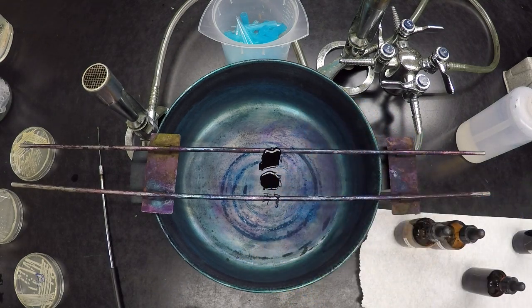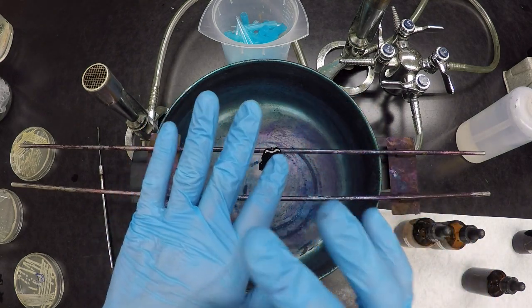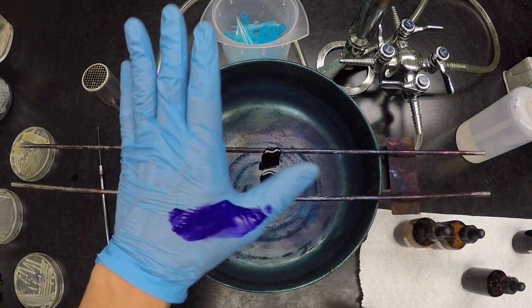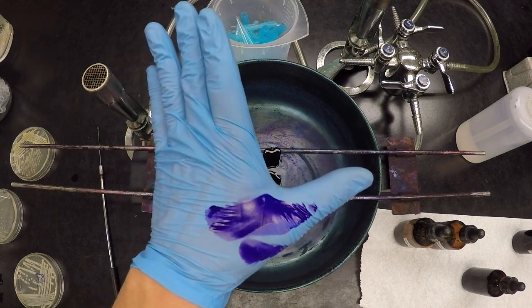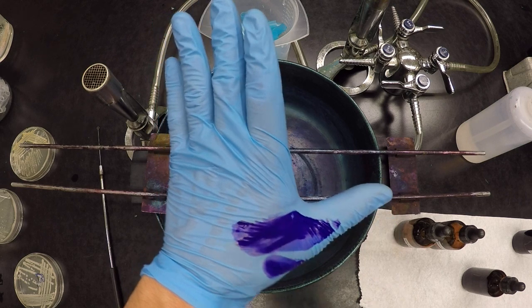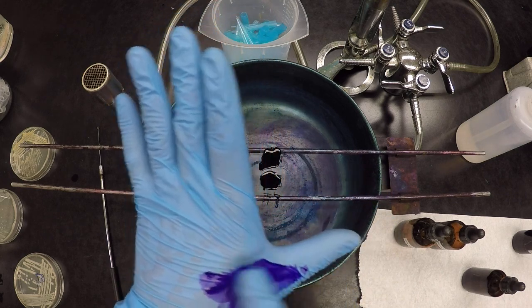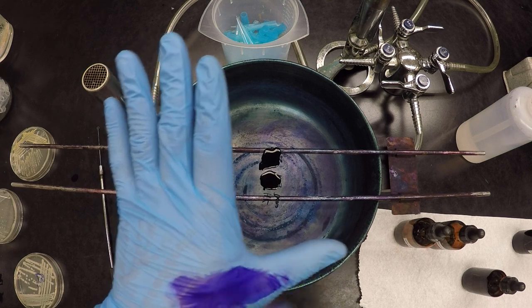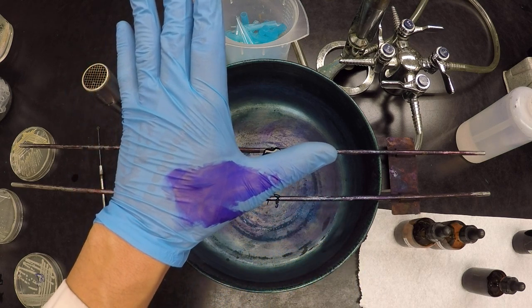Now, sometimes we're not even really sure what violet is, right? So what I sometimes do, you just go like this, and then put a little bit. That's actually quite a lot, right? But do you see that? That's the color of crystal violet, right? So when you're finished, this is what we're looking for, and so usually what I say is purple, because we don't know what violet is. Okay, so there's what our positives will look like.